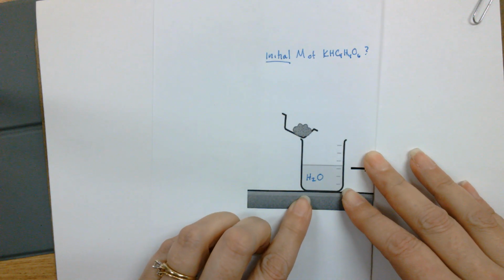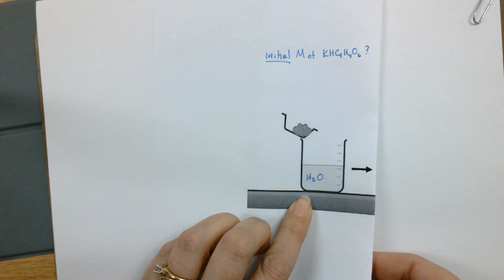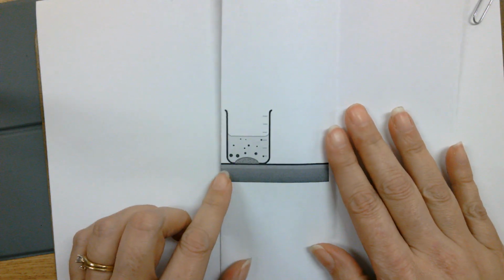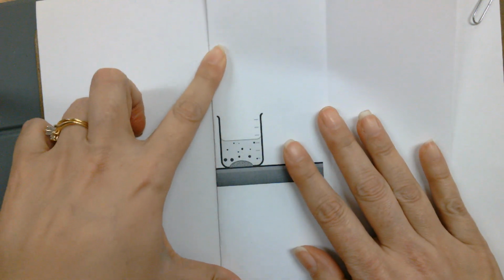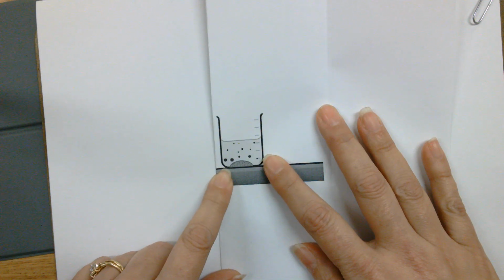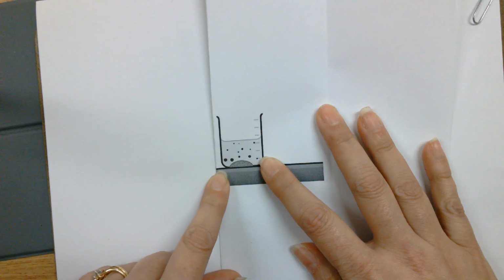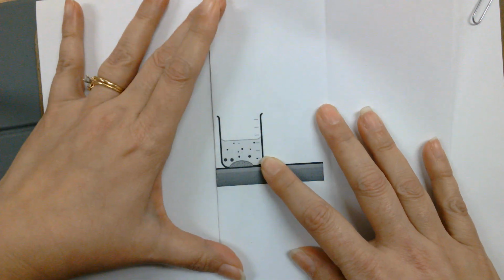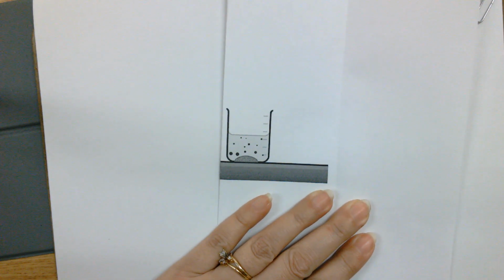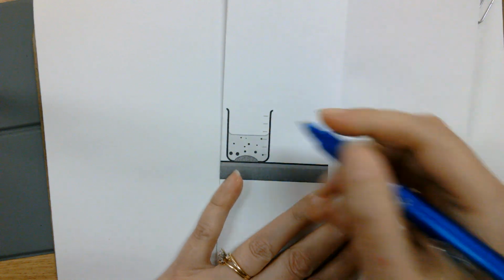So the point here is that we want to find the concentration of a saturated solution. When we saw the beaker at the beginning of class, it looked something like this. We had a solid in the bottom of it, and what we couldn't see visually, because we can't see molecules, is that there was some amount of dissolved potassium hydrogen tartrate floating around in the solution. This concentration is what I'm trying to find. This is the solubility. In this picture of the beaker, this would be all that is able to dissolve to make a saturated solution.